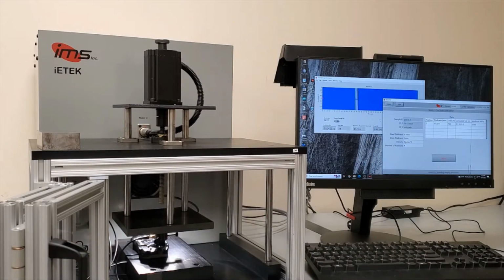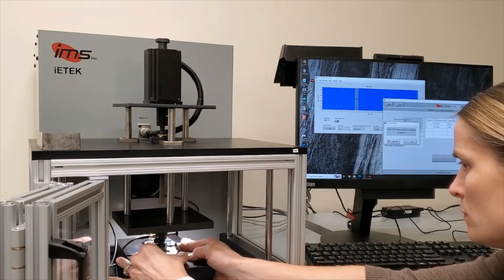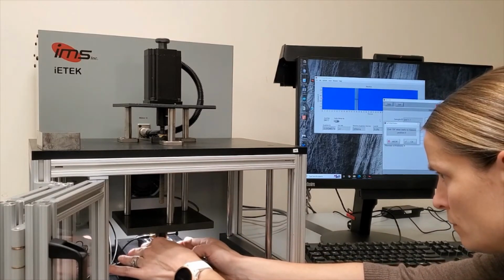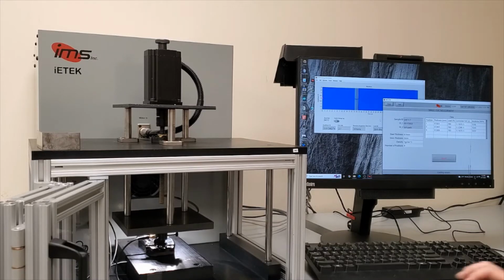But in this particular view, I just wanted to illustrate how the samples are loaded and unloaded. So the samples are put in this sort of vertical orientation and then moved manually from one position to the next. In this case, we measured 4 positions per pad.